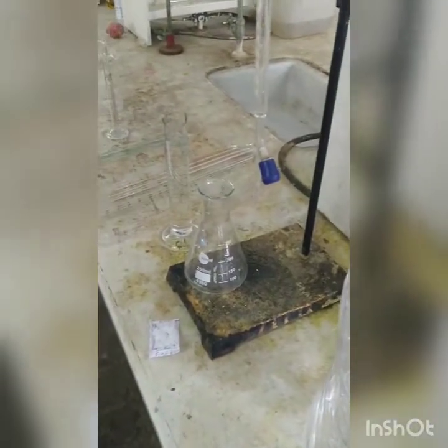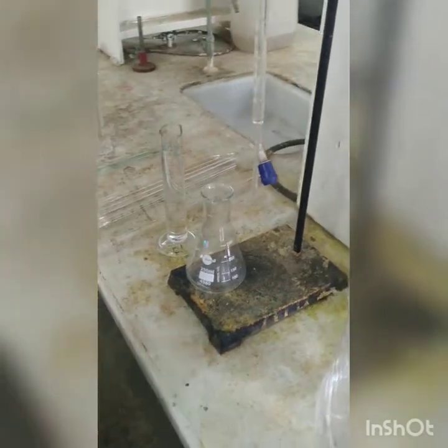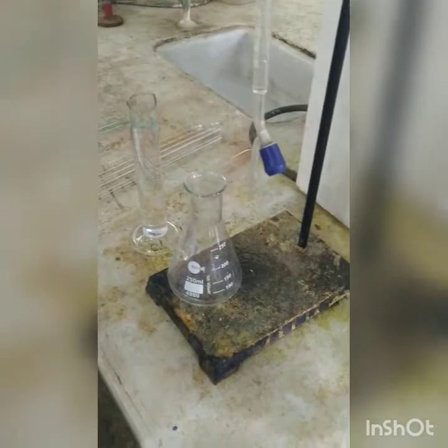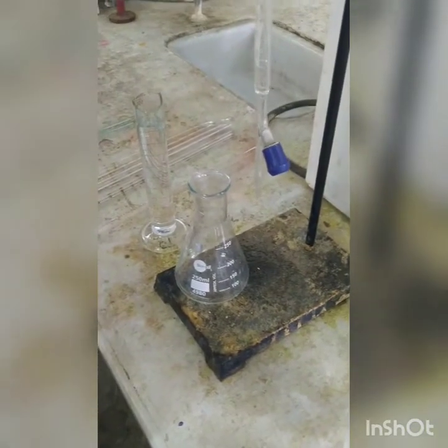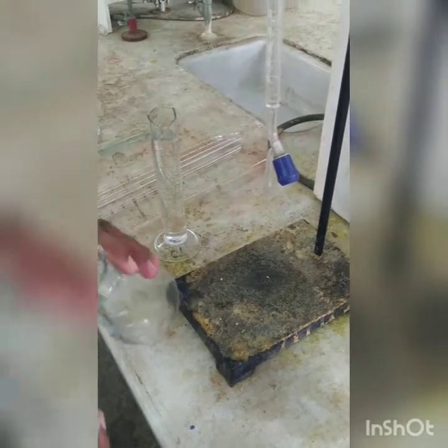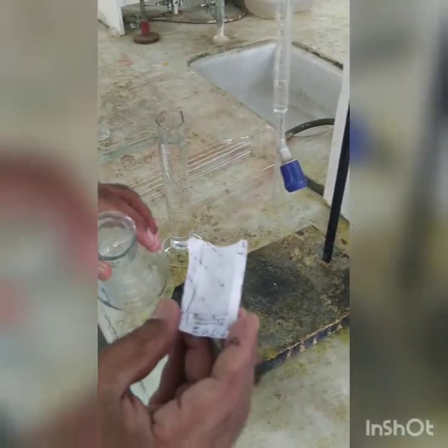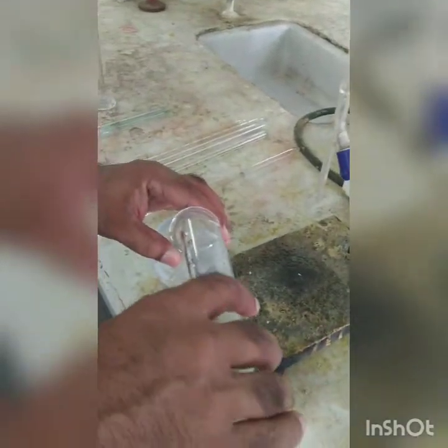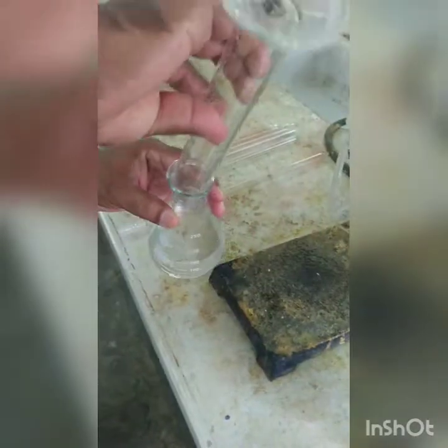So our titrant is sodium thiosulfate, which on exposure to environmental conditions changes its normality. So we have to standardize it. For that, this is the procedure. We are adding 2 grams of potassium iodide crystals in the conical flask. To this we are adding 100 ml of distilled water. So already 100 ml has been measured and we are putting 100 ml of distilled water.